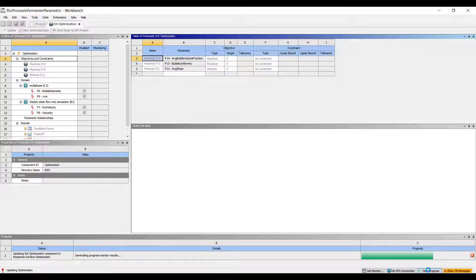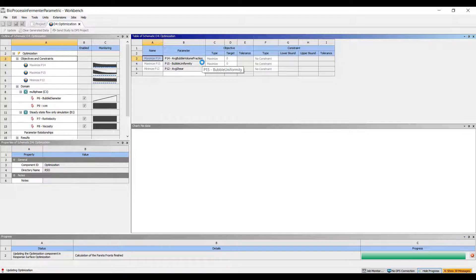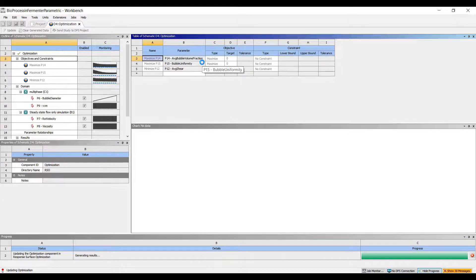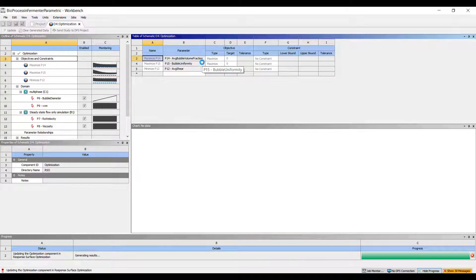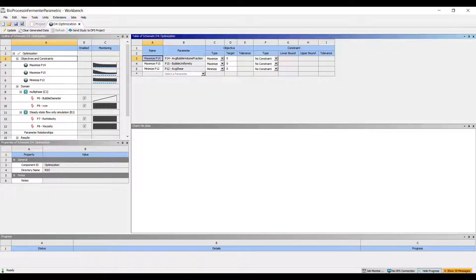It will try to use these particular parameters. I want to maximize the amount of air in my domain and make sure it's as uniform as possible. But I also want to maintain a low level of shear so that I don't damage the microorganisms inside of the fermenter. It's done here.